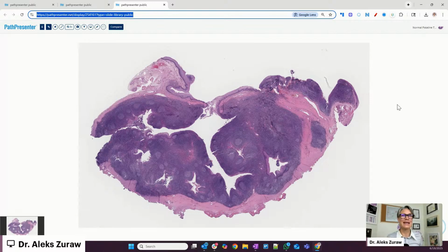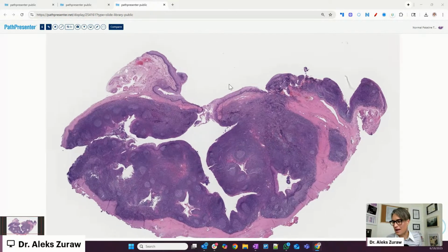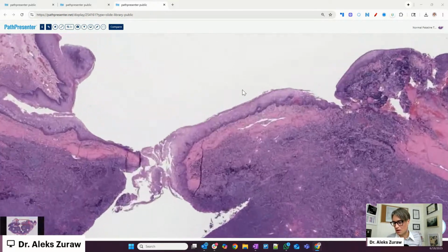And we're on our third organ right now. It's the tonsil, palatine tonsil. And there's one structure that will help us recognize that this is from the palate. These are the tonsils that kids get removed when they get too big and get infected all the time. And the structure that is gonna help us recognize that this is from the palate is actually epithelium.